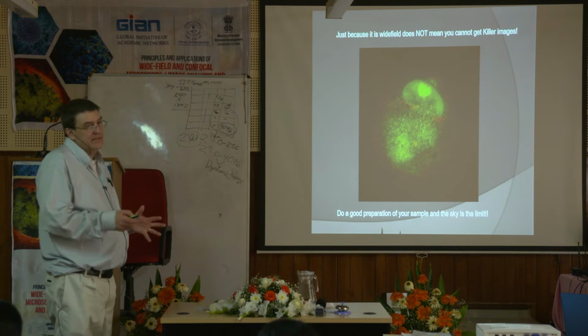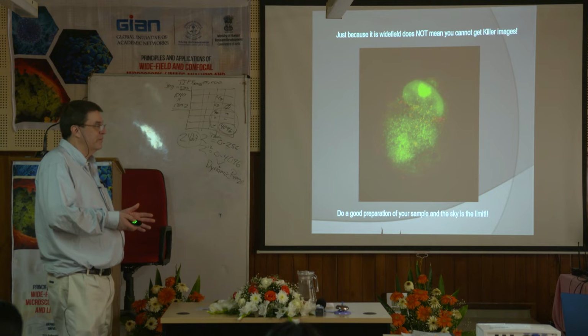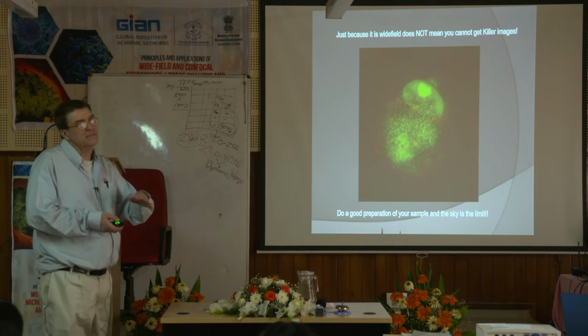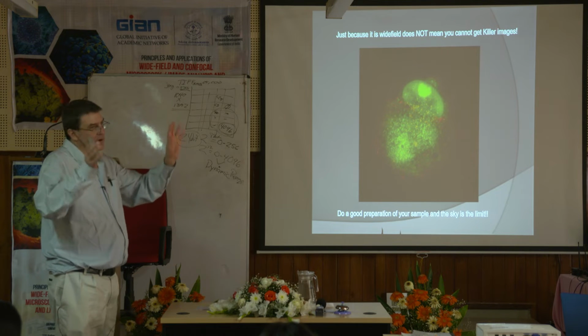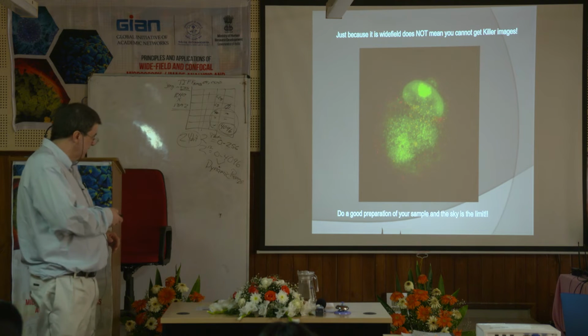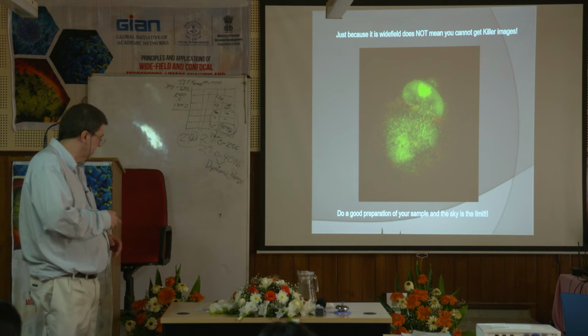And you always hear, people come and say, I want to go to confocal because I want a pretty picture. It's better. And a lot of times it is, don't get me wrong. The confocal can definitely give you a prettier, better image. But if you know what you're doing, you can get stuff like this off the wide field, which is a pretty fabulous image, actually, I think.